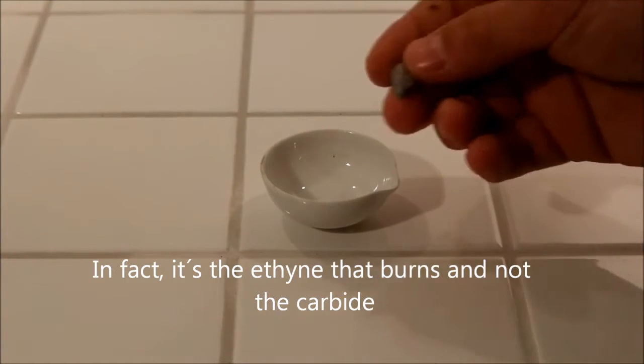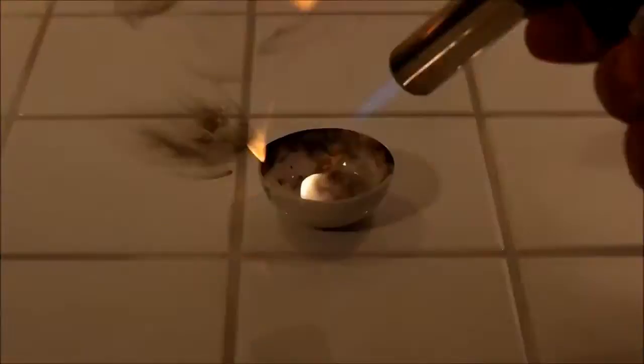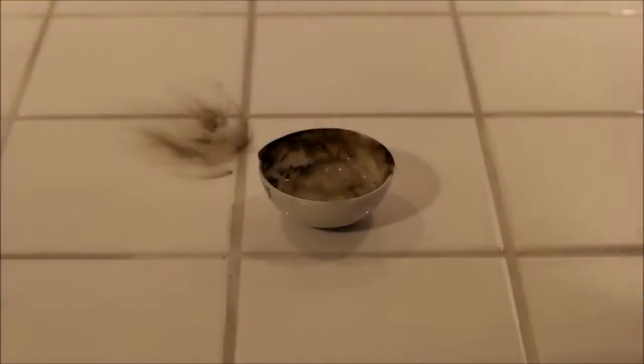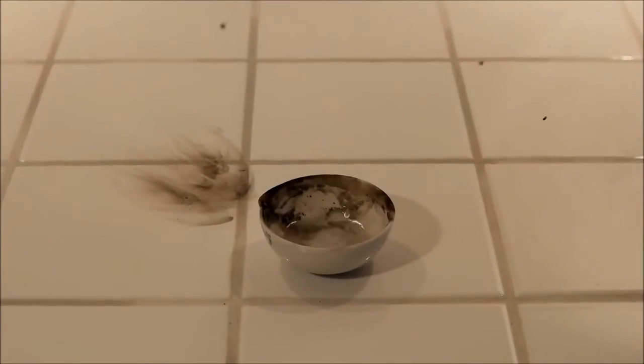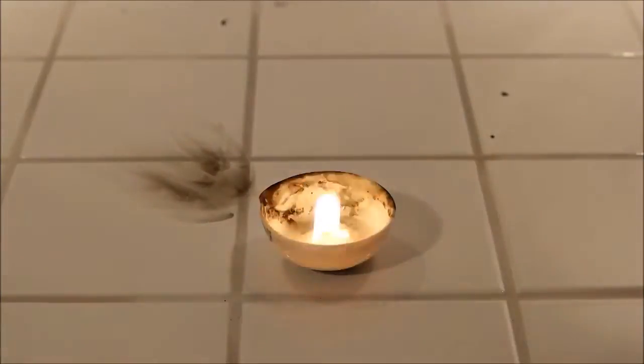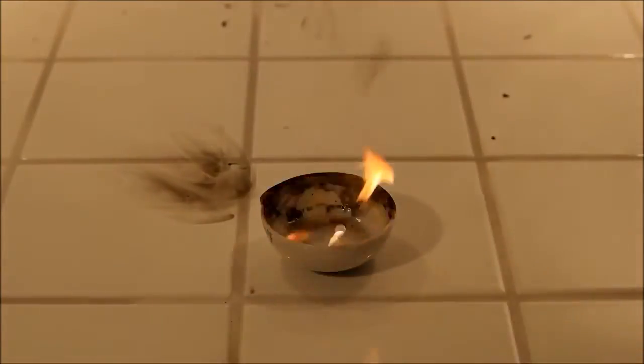So I put a small little piece of calcium carbide in there, and I put some water on it and light it up. What you can see is that a lot of carbon black is produced. You can see it flying everywhere, and that's clear when you look at the chemical formula of ethine. I'll show it to you later.